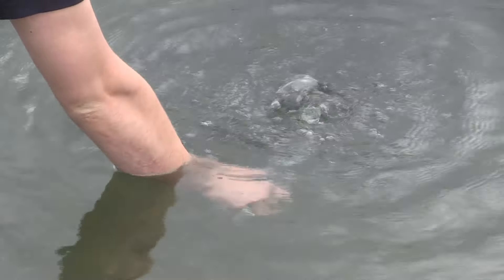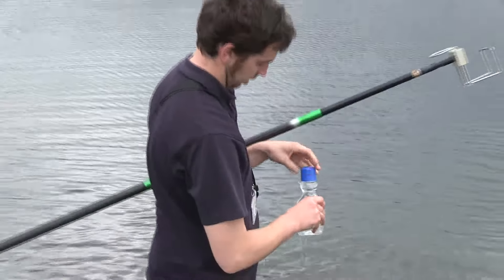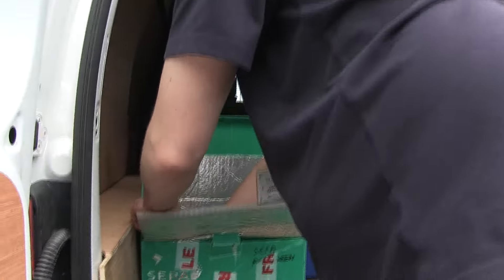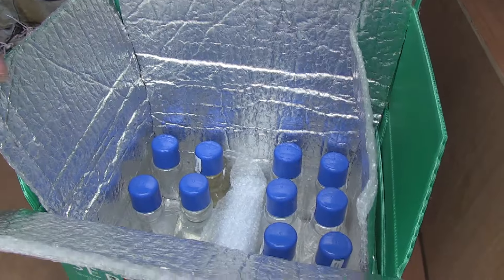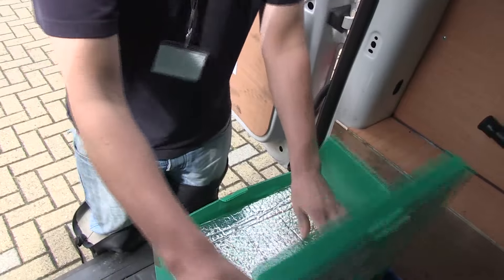We have to maintain a sterile technique and make sure you don't contaminate anything. After the samples are collected I store them in a cool box in the back of my van, which has ice packs in it to maintain a cool temperature and keep the samples in the dark until they're back at the lab.